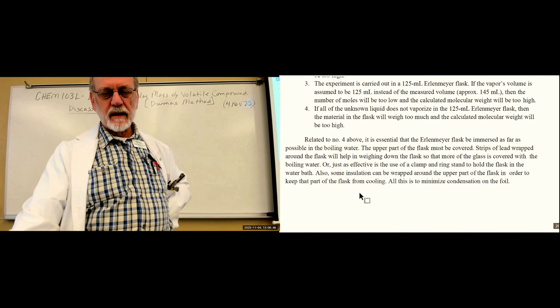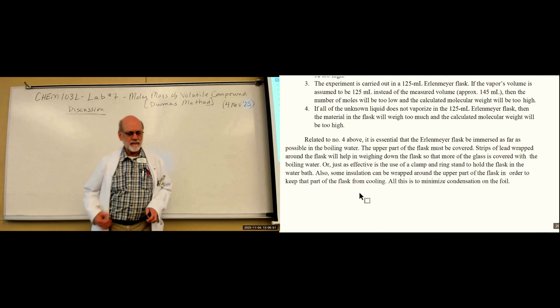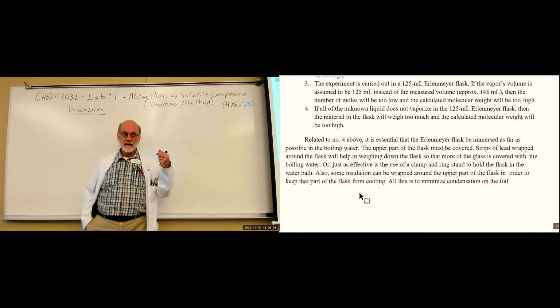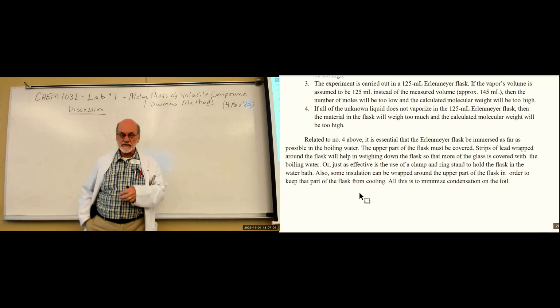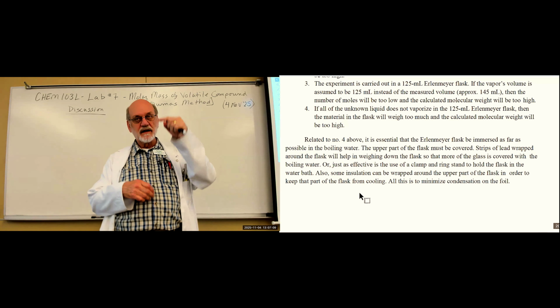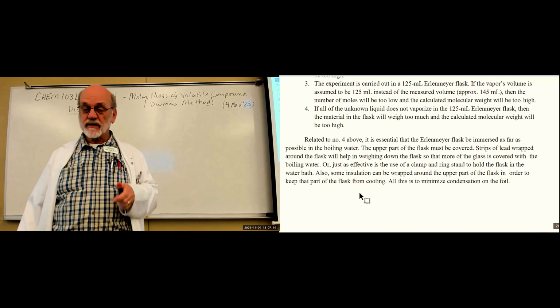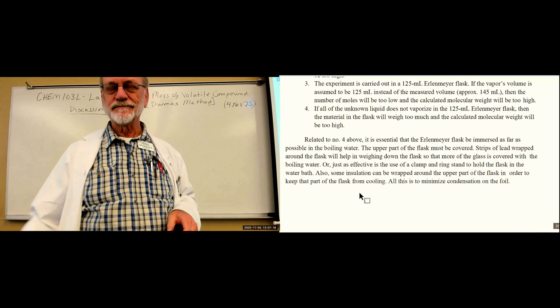Now, I don't know, should I offer you this option? There's another way to determine the volume. It's not as accurate as getting the mass of the water and determining its volume by its density. And it's simply just filling the flask up to the lip where you think the gas was occupying, pour it into a graduated cylinder and measure the volume. Graduated cylinders are not that accurate. That's why I went to the density option.